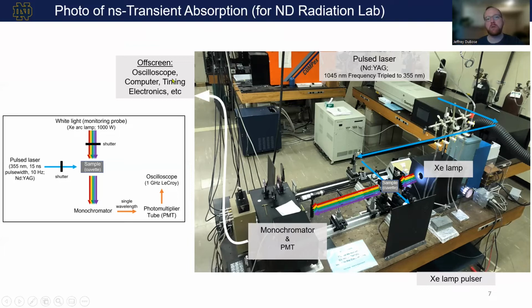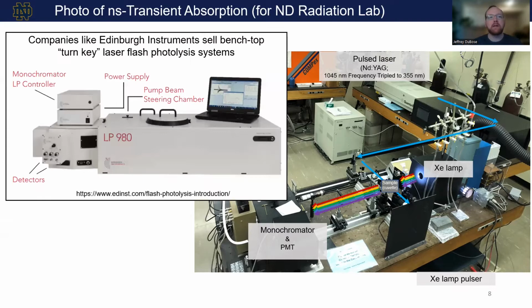So you might be looking at this and thinking, wow, this looks kind of intimidating. I personally couldn't just go and set up one of these myself because you have to have a lot of timing and electronics. These systems can be pretty complex to make a home-built version of. So if you're thinking, oh, this seems difficult, luckily these days there are companies that sell commercial systems.